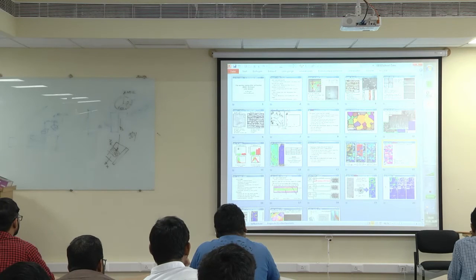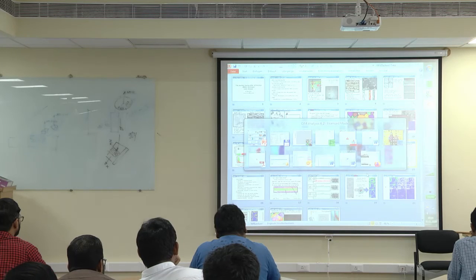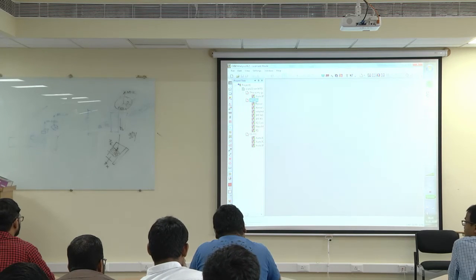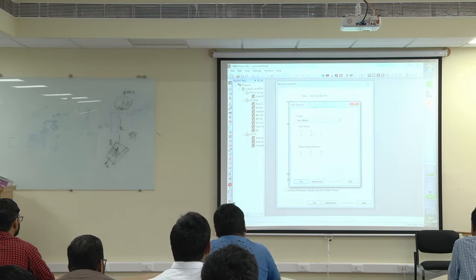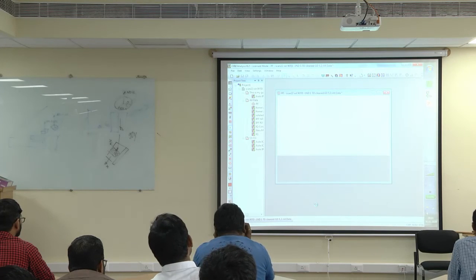And let's see whether I can get that software running again. I would really like to, oops, there it is still running. Grain spread doesn't work. Let's delete that one. But let's go and calculate again these pole figures, discrete pole figures. This one and 111.